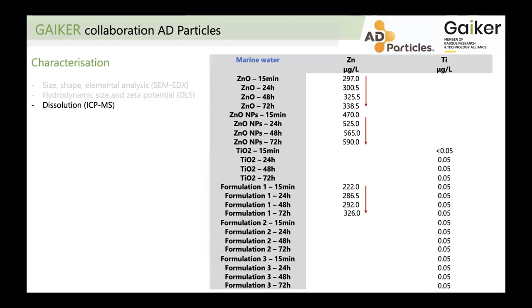Concerning the dissolution of this material, this was also performed in marine water. Here is just a representation of the whole experiment. We performed the dissolution up to 72 hours, starting from 15 minutes. We can see that zinc dissolves in marine water. Both zinc oxide bulk and zinc oxide nanoparticles dissolve in marine water. We could also observe this dissolution in formulation number one, with an increased amount of available zinc from this formulation. For titanium dioxide, dissolution of these particles was not noticed in the different formulations, nor in the single titanium dioxide sample suspended in marine water.